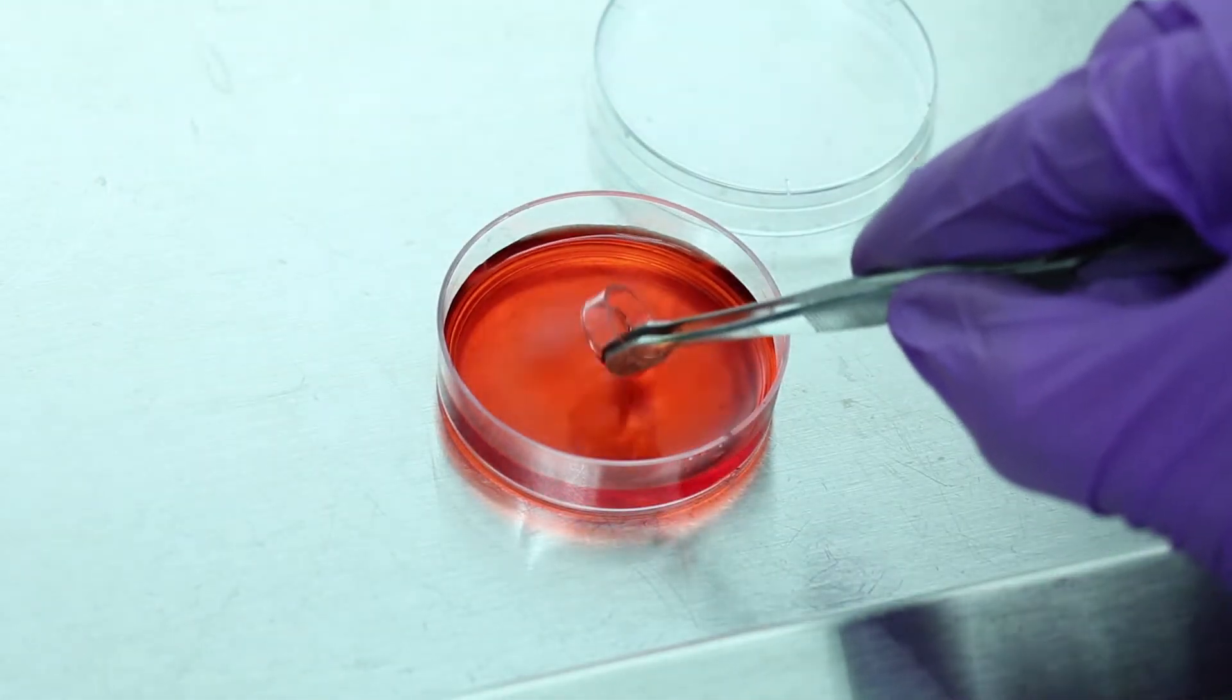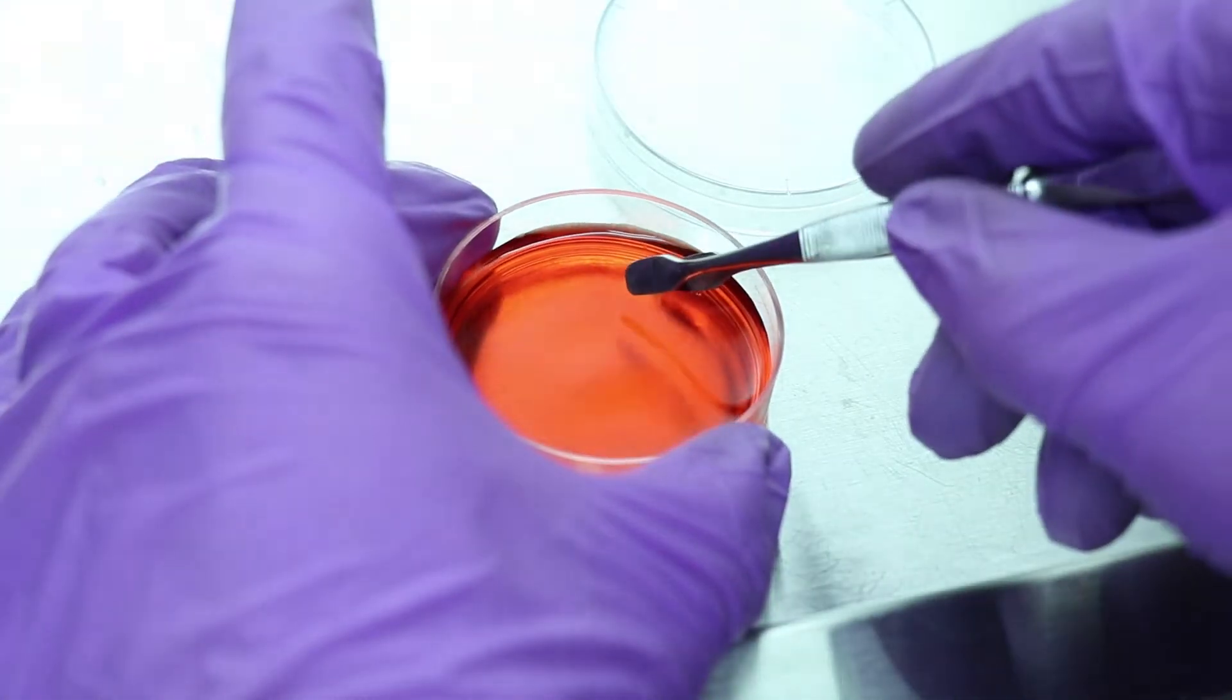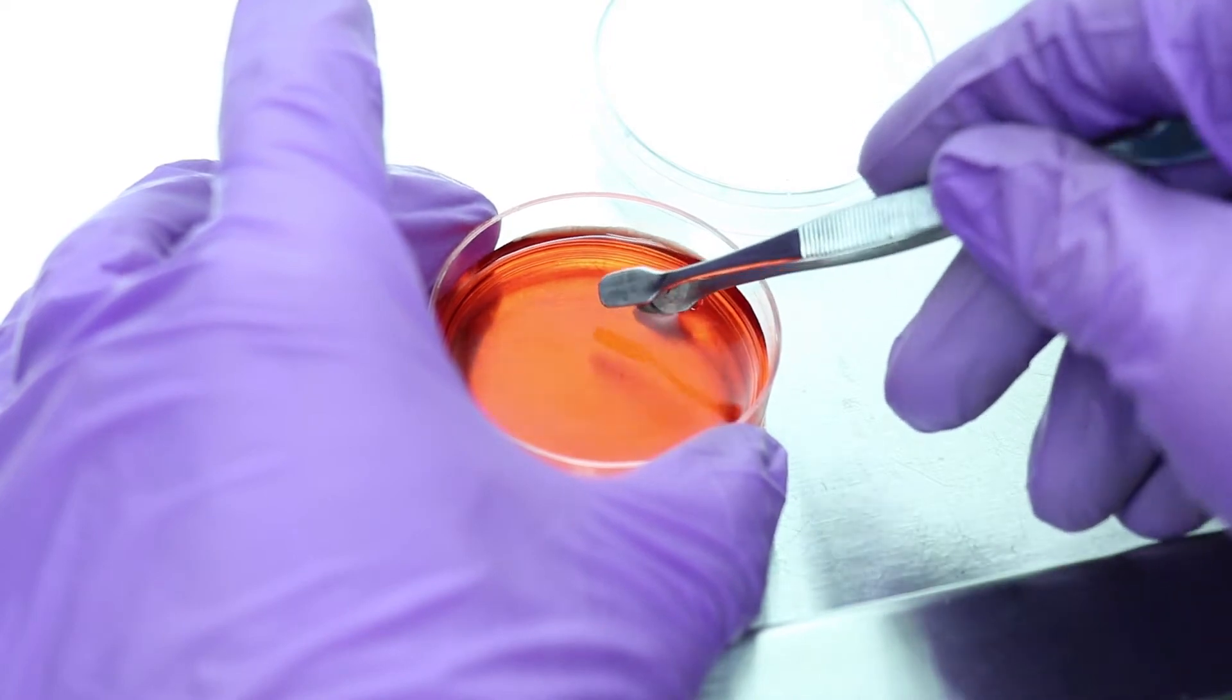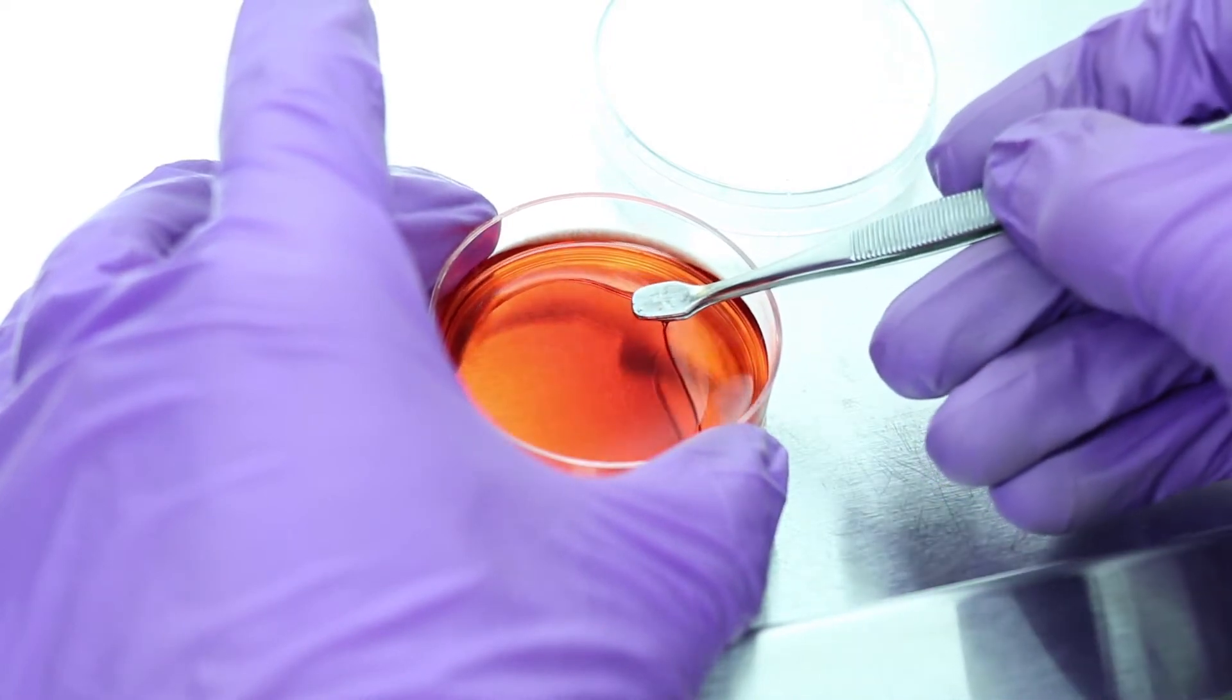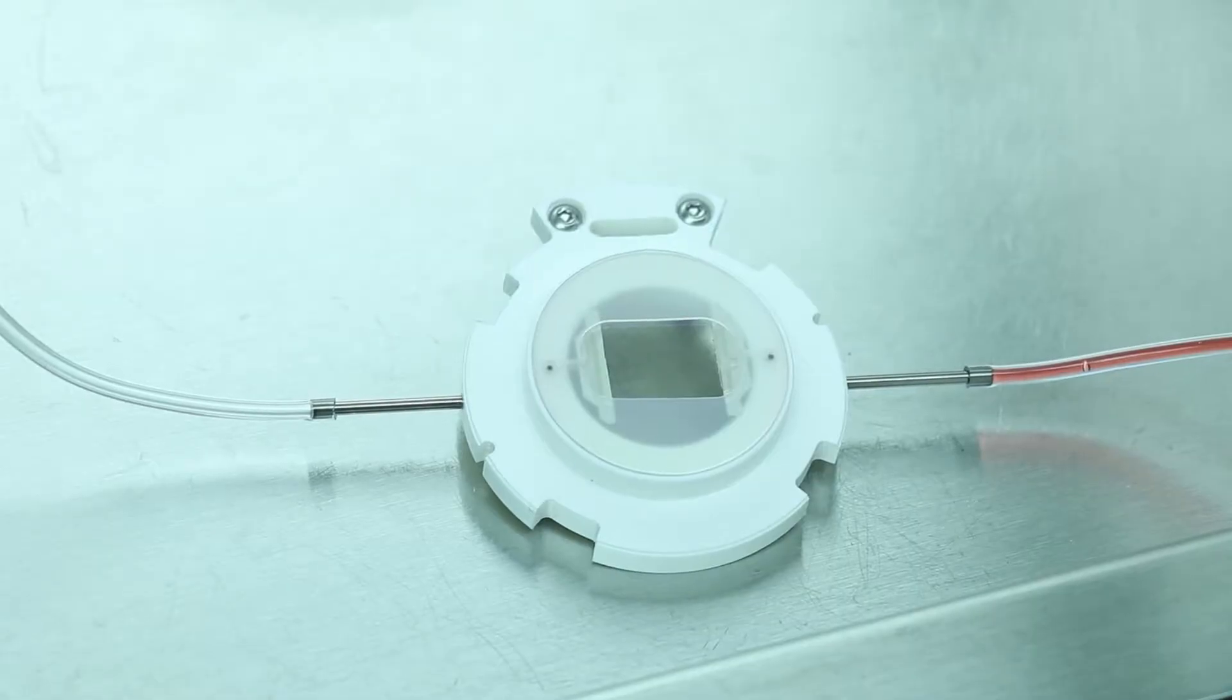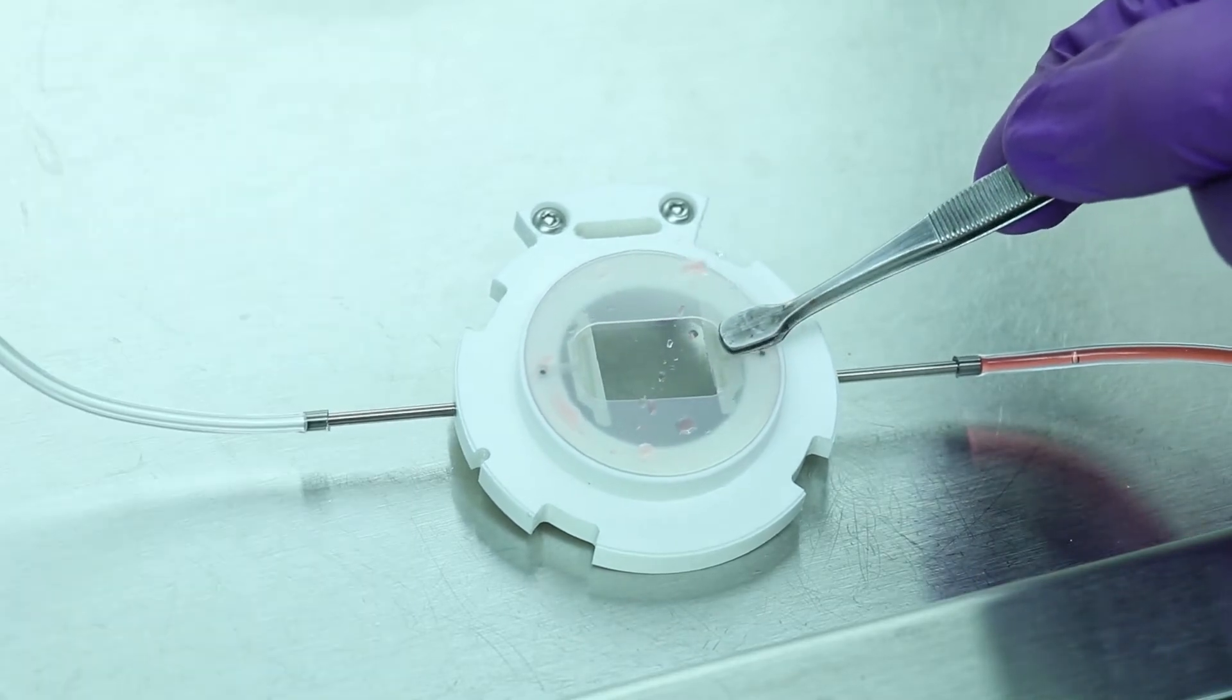Taking forceps, remove the culture cylinder. Then slide the forceps under the 40mm cover slip and remove from Petri dish. Place the 40mm cover slip, sample toward white top with gaskets.